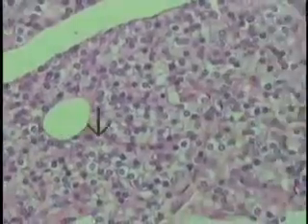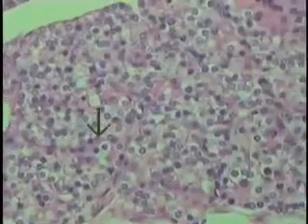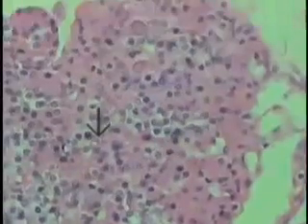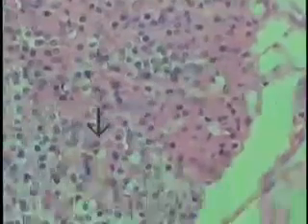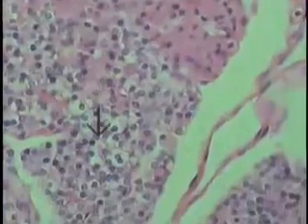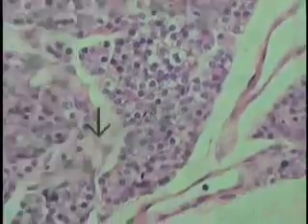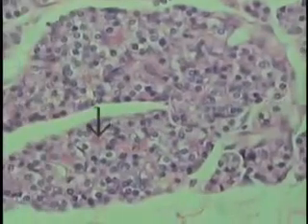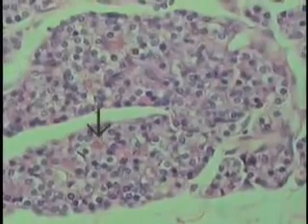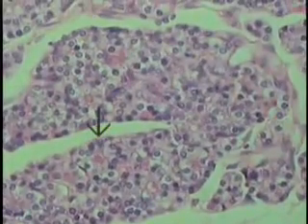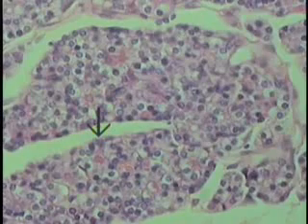If this were a specimen from an older individual, then another very prominent cell type that would come into the field would be that of the fat cell or adipocyte.